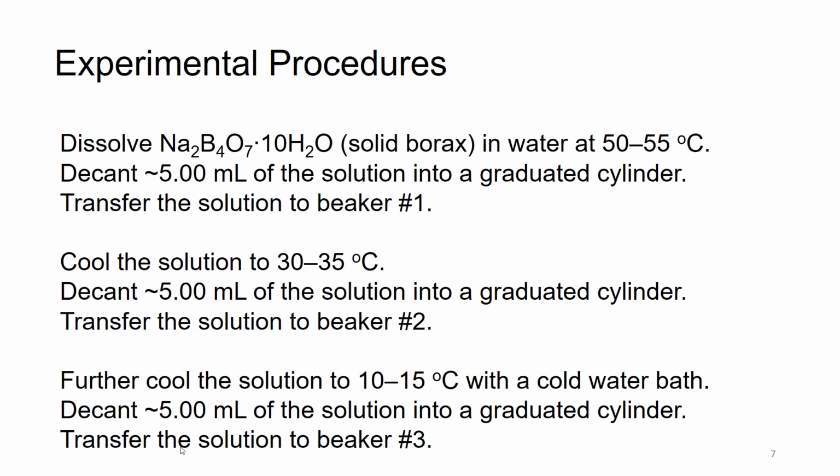Now let's talk about the experimental procedures. First, you need to dissolve solid borax in water at around 50 to 55 degrees Celsius. Dissolve as much as you can to form a saturated solution of borax.